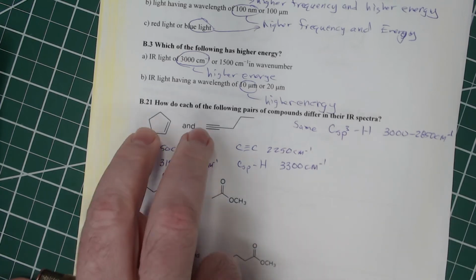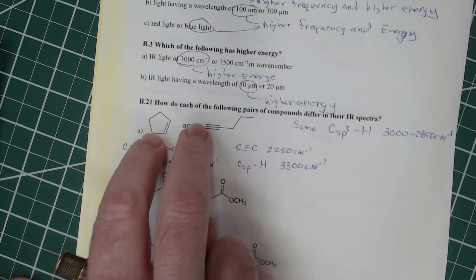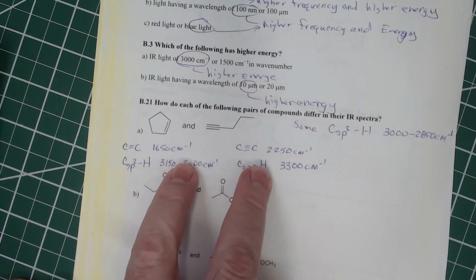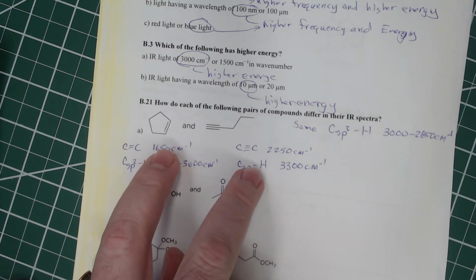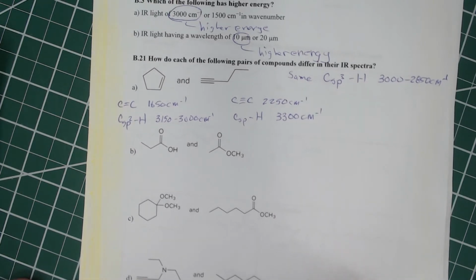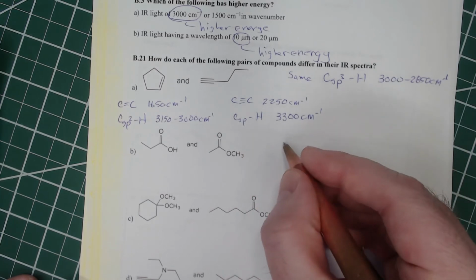So if you put these two compounds, which are isomers of each other, into the infrared, you should very clearly be able to tell which one is which. And you know, these will be the same, but this will be different than that. All right, let's do the same thing with part B. So on part B, we've got, well, again, let's look at what's the same.